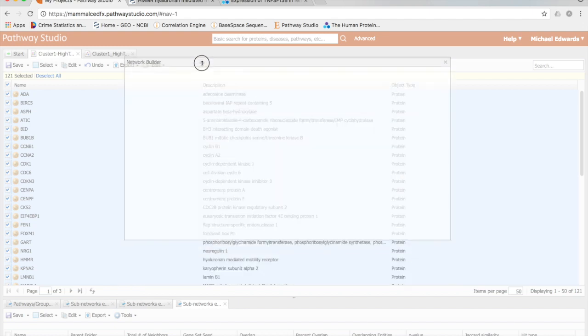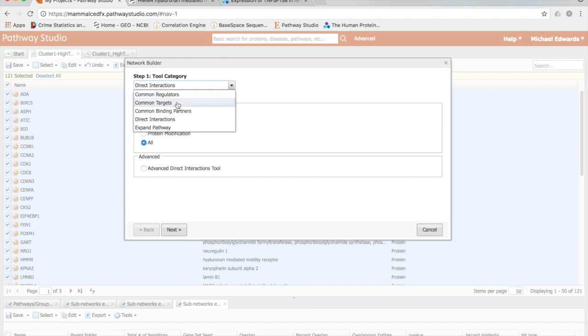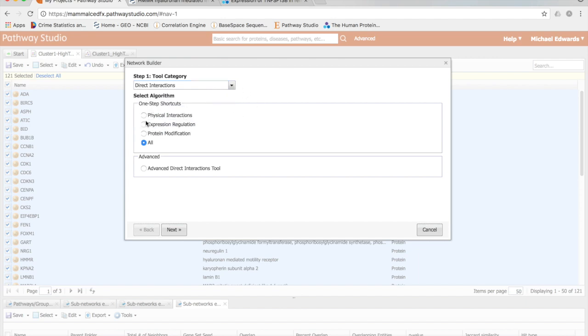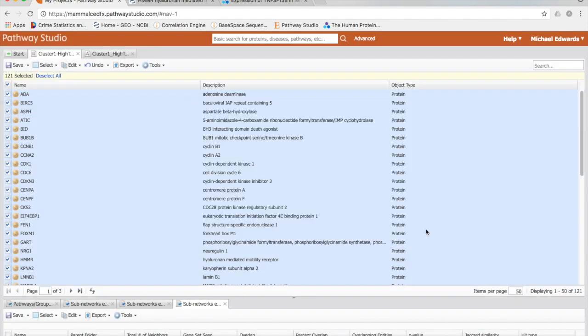To start with, I'm going to look at Network Builder, which would be kind of similar to String, where you're building that graph showing the connections between different genes. You can have several options for this: direct interactions, common regulators, common targets. You can look for specific interactions if you'd like. Basically I'm using the defaults, so I'm getting any interaction I can, but they do have to be direct. This usually takes a while, so I have already done this.